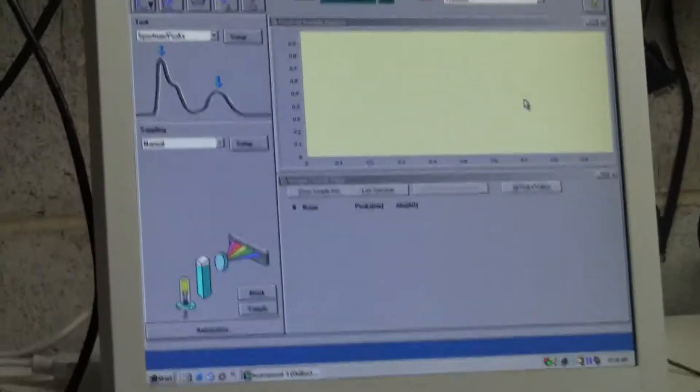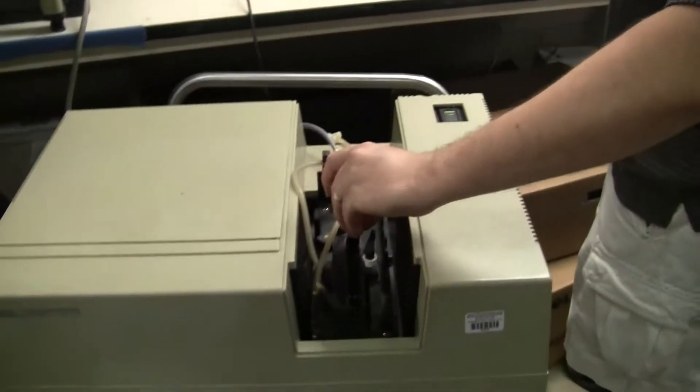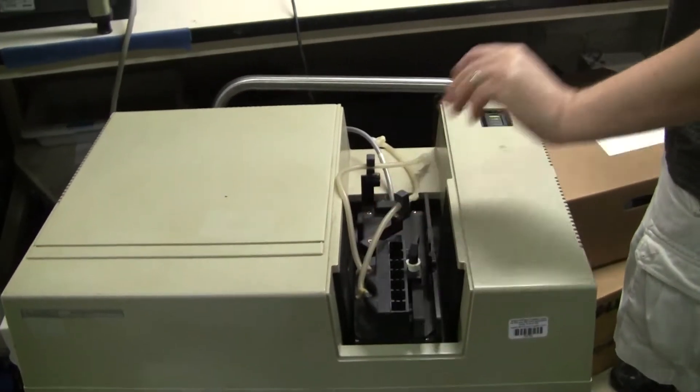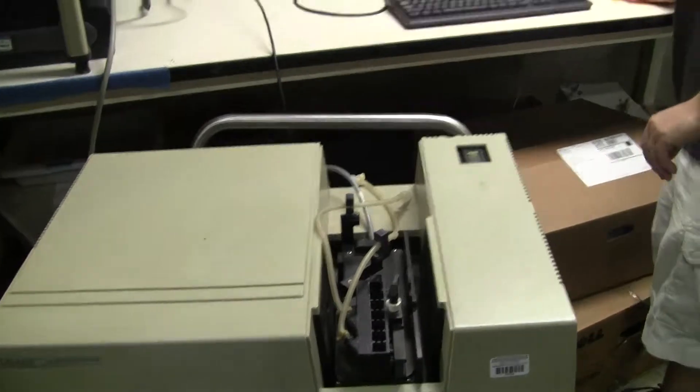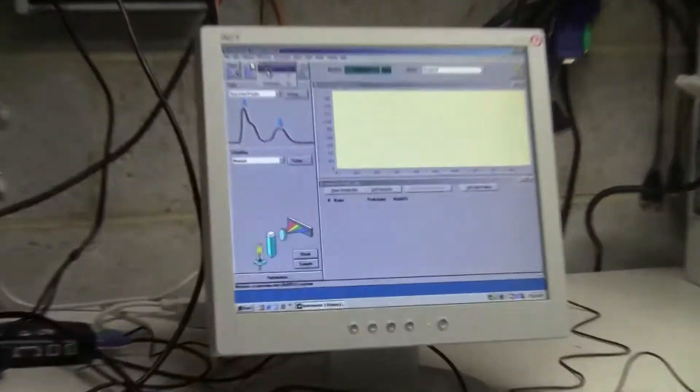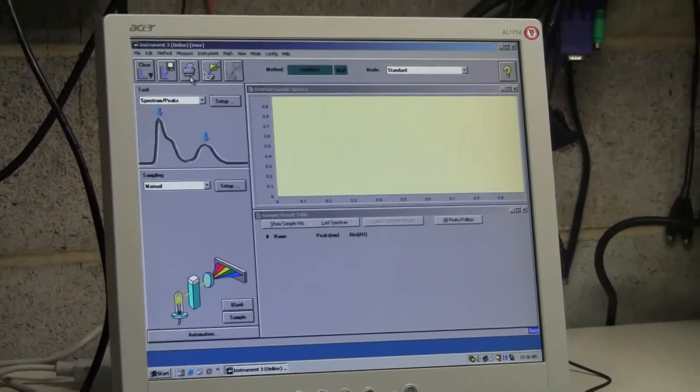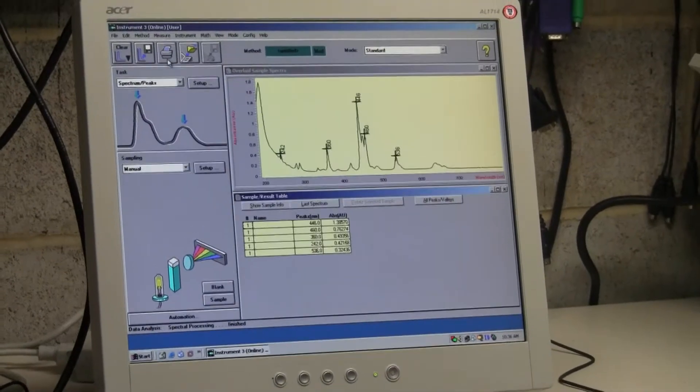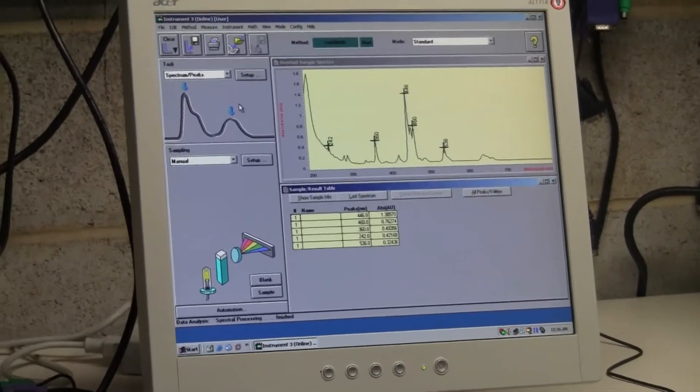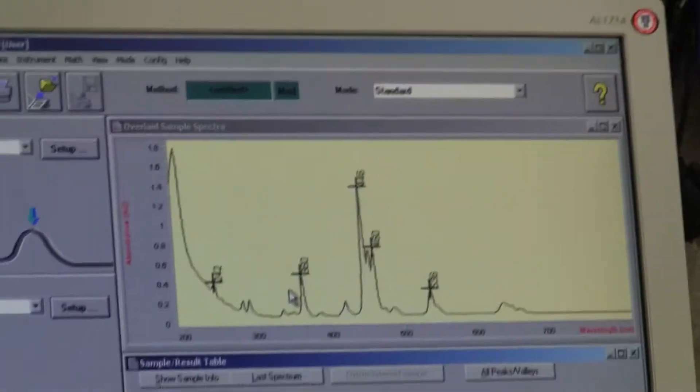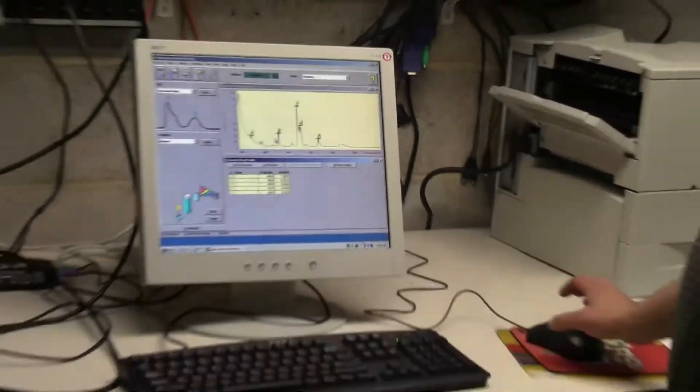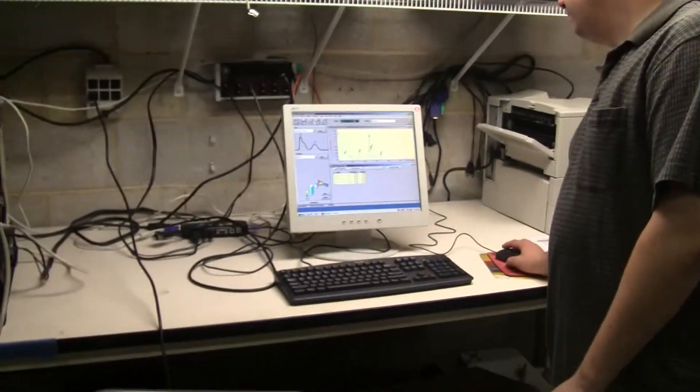I'm going to put in a standard holmium sample. Ask it to measure the sample. And quite nicely, it'll measure the holmium sample with the standard peaks. The instrument does check out.